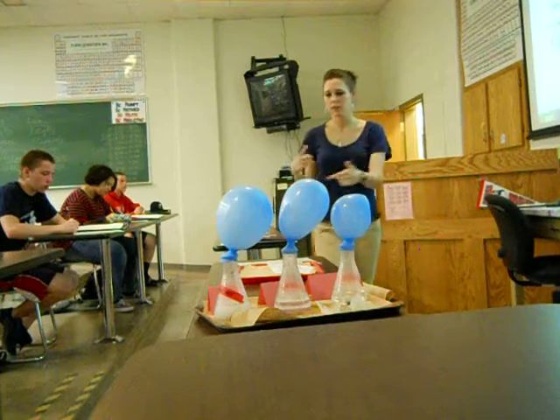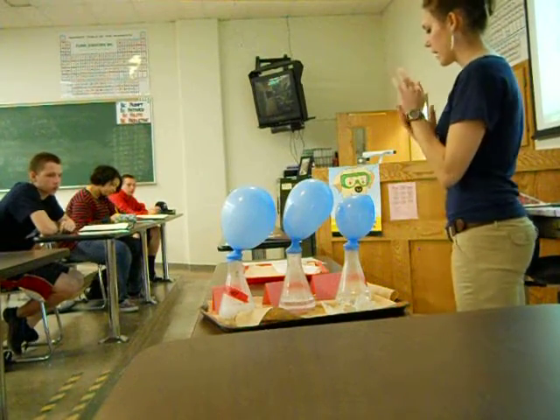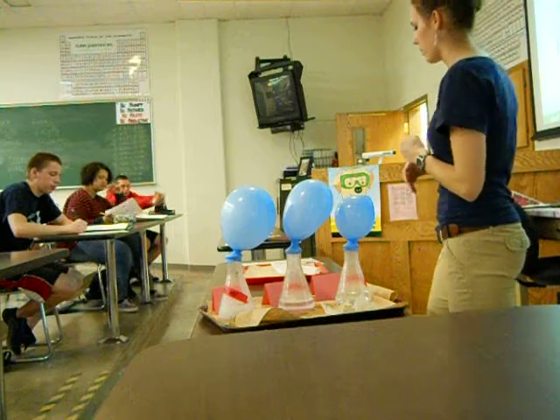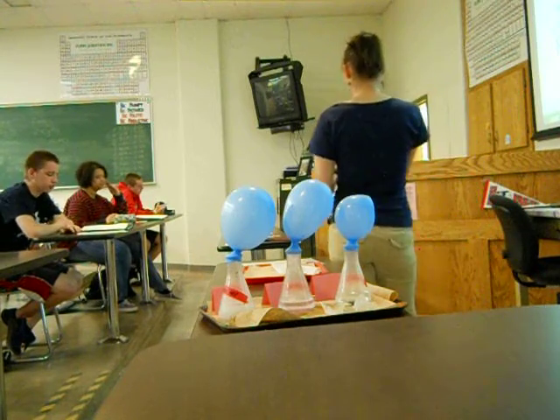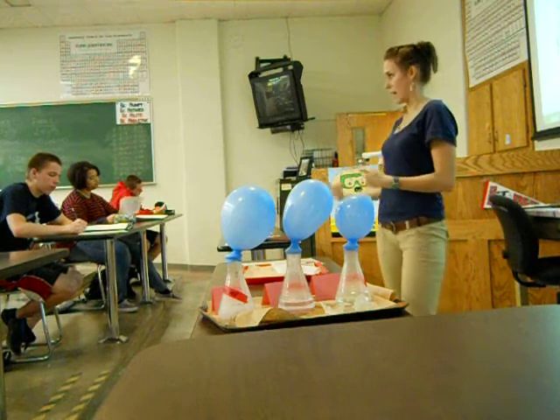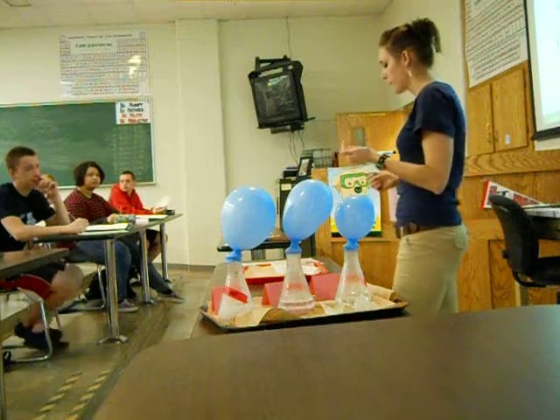And we're going to identify our limiting reactant for each. So for flask A, what's our limiting reactant there? The magnesium. Right, magnesium was LR, or limiting reactant, which means that our HCl was in excess. Makes sense. That one had the least amount of magnesium.